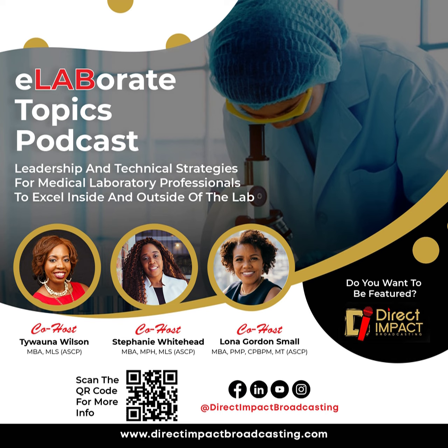And I'm going to talk a little bit about how you actually work with these technical considerations when you're looking at your stakeholders, the lab executives, the technical directors coming together. How do we make these decisions? Because I know we're like, okay, check, check, check, but there could be a lot of different instruments that you're trying to make a decision about that may have a lot of the same things. How do you really make that decision to choose an instrument?